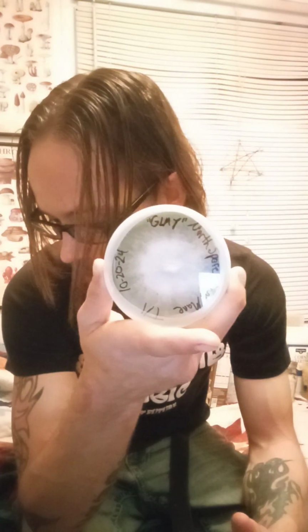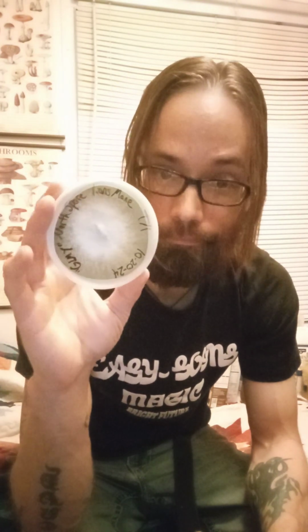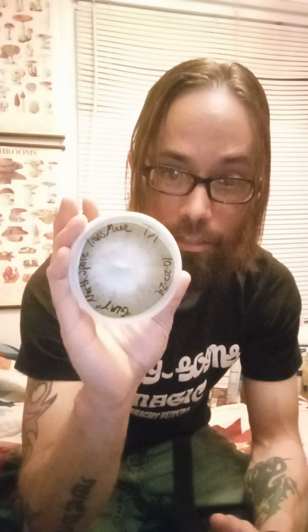And then GLMY, that is grits, light malt extract, and yeast. Lion's mane is a wispy mycelium. This, at no higher rate than anything else I use, 2 to 2.5%. Usually lion's mane is like a little wisp you can barely see across the plate, with a good concentric ring, a good center ring. Lion's mane is just light and wispy. That's what it does.